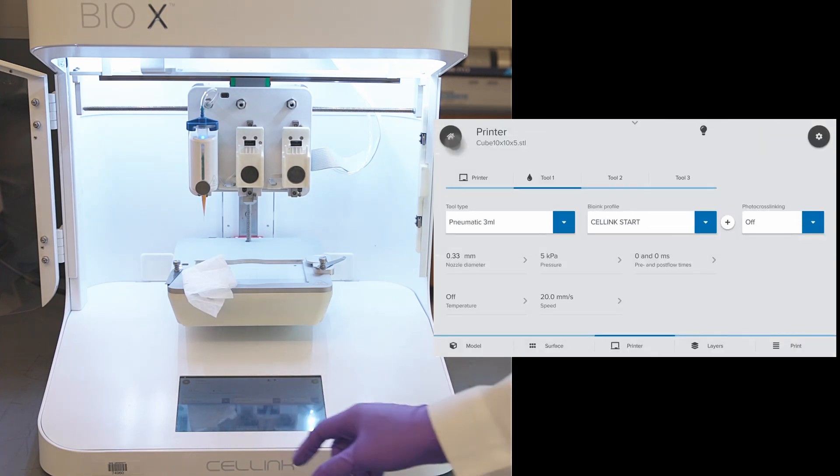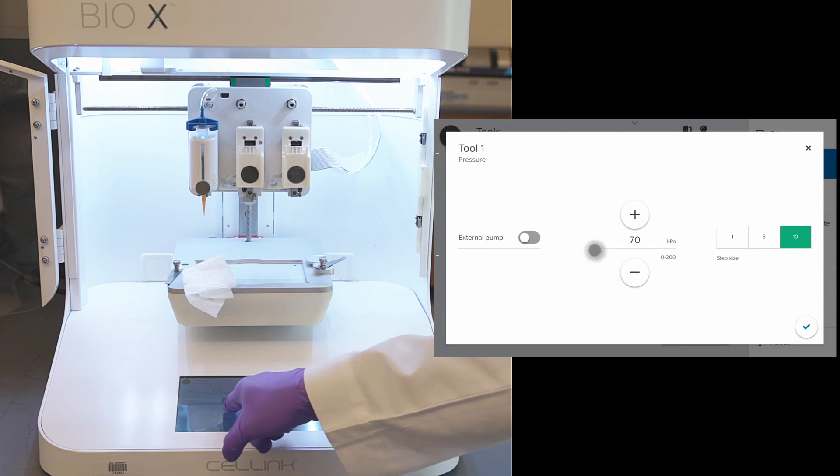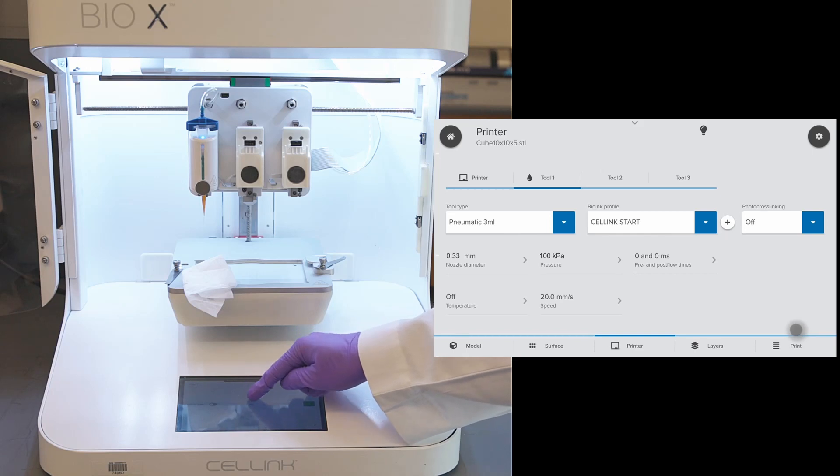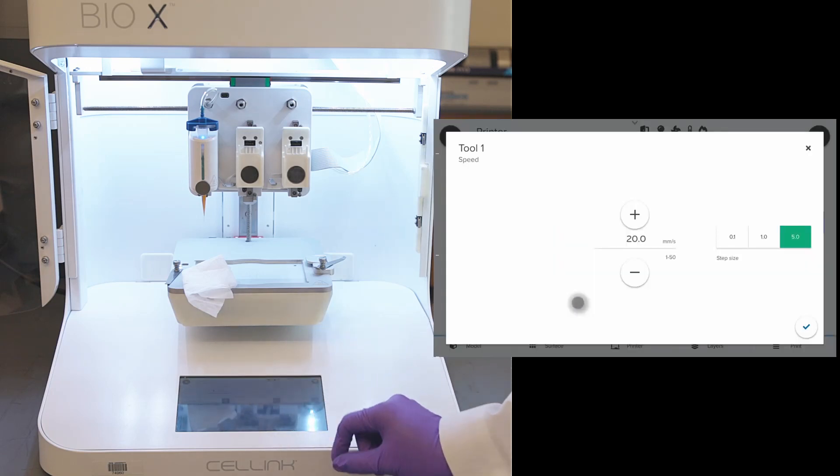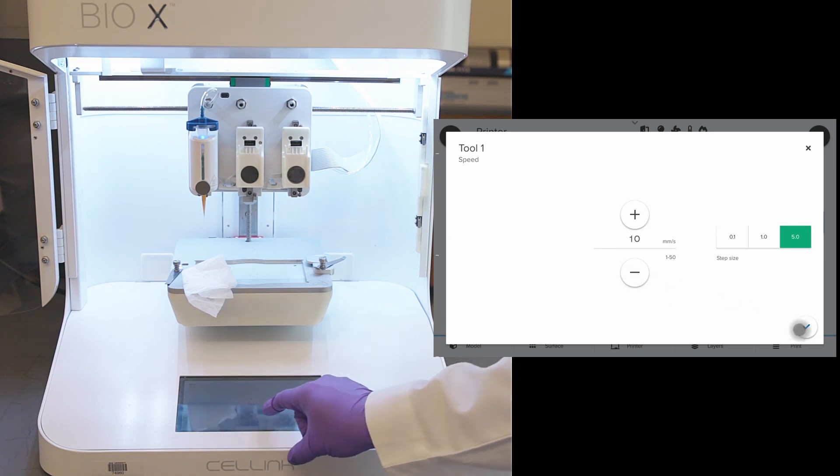Now, click on the home button to get back to the printer option. Here, we go to pressure and change the pressure to 100 kPa and hit OK. And the printing speed, we can change it as needed. I am going to reduce the speed to 10 mm per second and click OK.